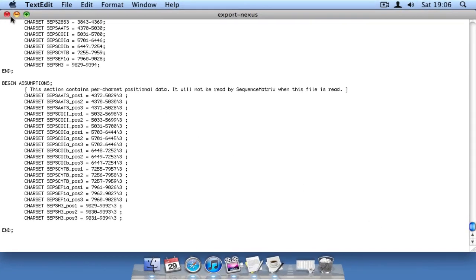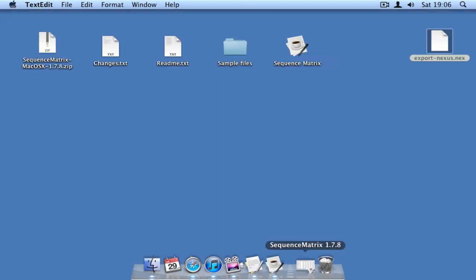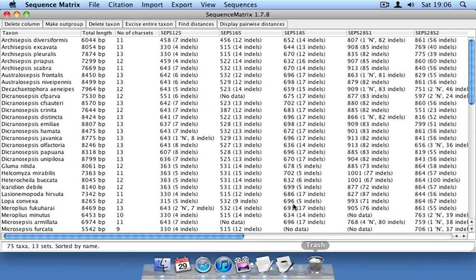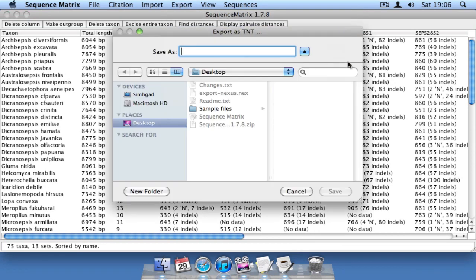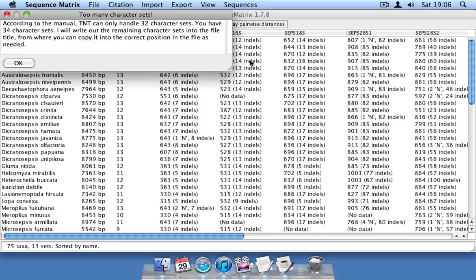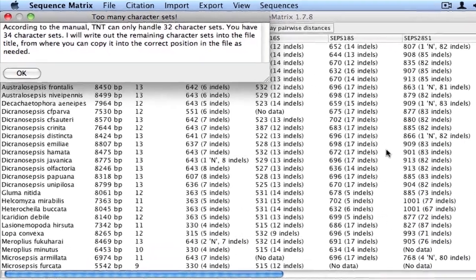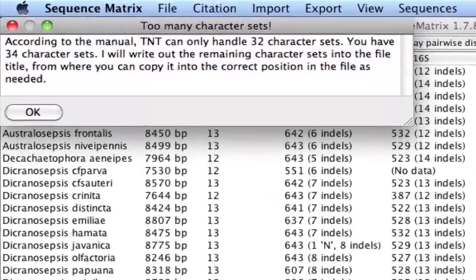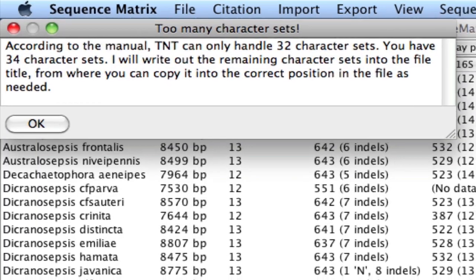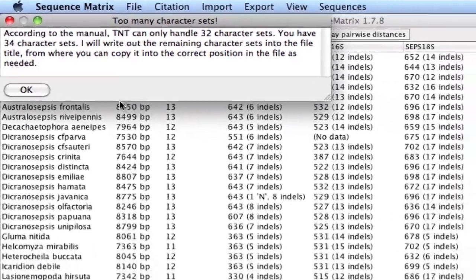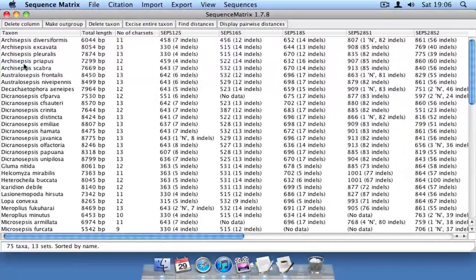Let's go back to Sequence Matrix and re-export these same data as a TNT file for parsimony analyses. TNT will only let you import up to 32 character sets. We've got 34, but Sequence Matrix will still allow you to export that many.